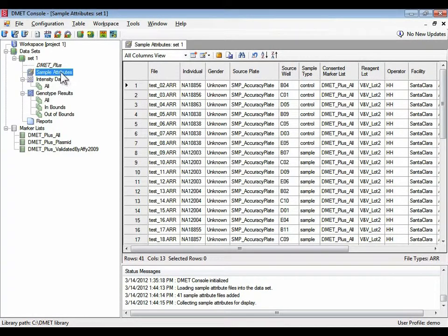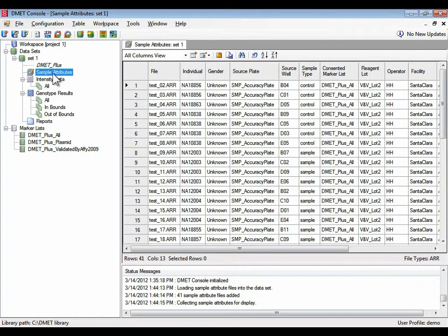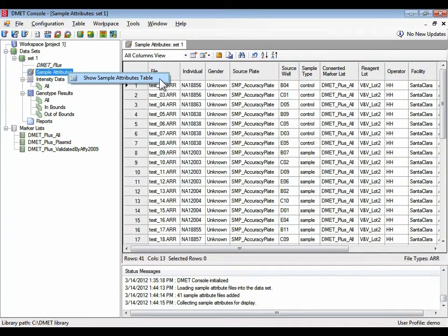You don't see pointers to individual files here. Instead, the way that you interact with individual files within these groups is by selecting a group and saying something like show sample attributes table.